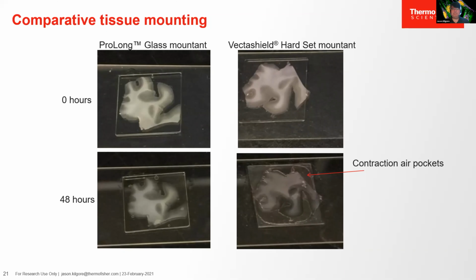All right. Okay, so thank you guys for having me. This is a very exciting topic right now. I would say that a lot of past applications that we all grew up with were often limited by the fluorophores available for the assay. And that is not the case anymore. We are absolutely in an explosion of reagent possibilities.